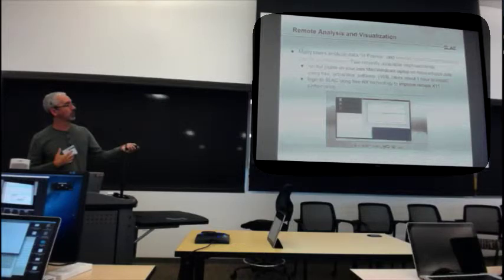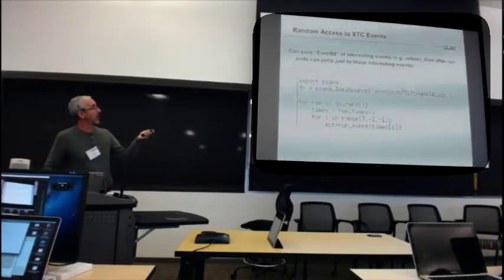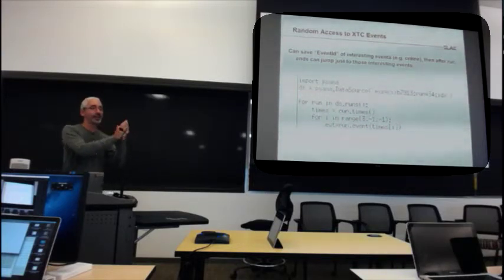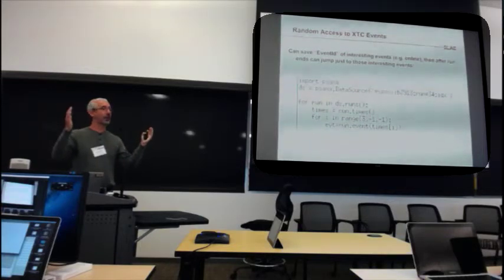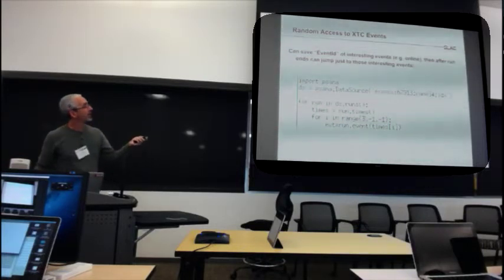Okay, so here's the random access to XTC events. What you can do is, even when you're running online, for example, running in real time, you can say, aha, here's an interesting event, and you can save its ID to a little tiny file. Maybe it's events that have a lot of hits, for example, in your crystallography language. You could save, these are the event IDs that are interesting. And then here's the code to jump to just those events.